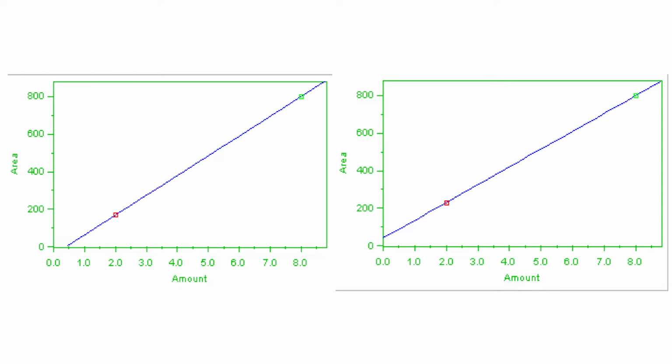Apologies are extended in advance for any confusion that may arise from the fact that the several levels in the calibration file may refer to the same, or different, amounts. Consider the calibration curves in the following figures. Here the calibration curves are straight lines that pass exactly through the 2 data points, but not the origin, which is completely ignored in the process of curve fitting. Therefore, the relationship between amount and response is linear, but not proportional.